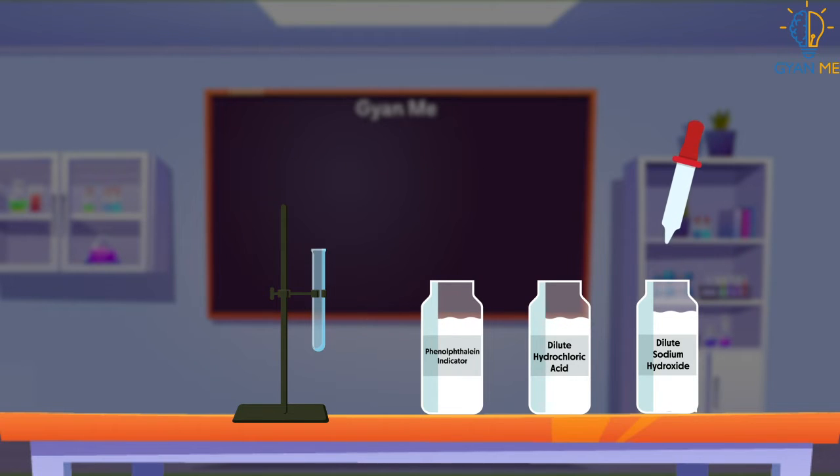Now we take about 2 ml of dilute sodium hydroxide solution in a test tube and add 2 drops of phenophthalein indicator and observe the solution. What do we observe? Yes, you are right, we observe that the solution turns pink in color.